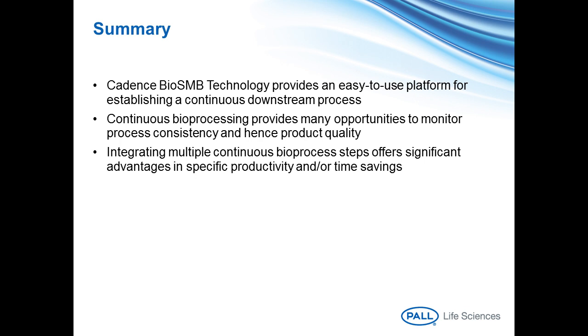Well, the approach we're taking is that we are building the system as we originally intended to do, which is the large-scale system where we have a single cassette with the same architecture and the same valve technology that we use in the PD system that's currently being tested for large-scale applications. So the large-scale system will have capabilities way beyond what we've seen in the PD system, and we actually target a 2,000 liter bioreactor for the large scale application. So yes, the technology is scalable without having any inflection points in the technologies we use. I wouldn't say direct scale up, because essentially the PD system is a scale down of the manufacturing system. And with that, all the other steps will also scale up.